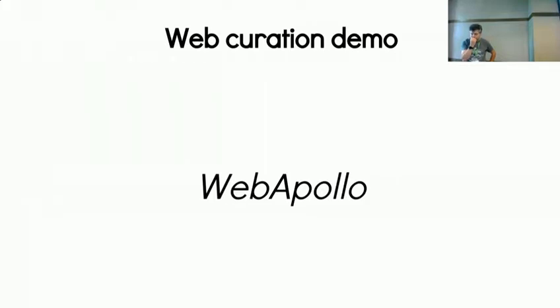What we're finding though is that when people are starting to do more populations, and you want to annotate an individual, you can use the same mechanism to say, here's what's going to be different in the proteome of this individual, because they've got a variant right here. And yeah, we're using the dbSNP definition of a small alteration, which is 50 base pairs or under. So you can do an insertion or deletion of up to 50.